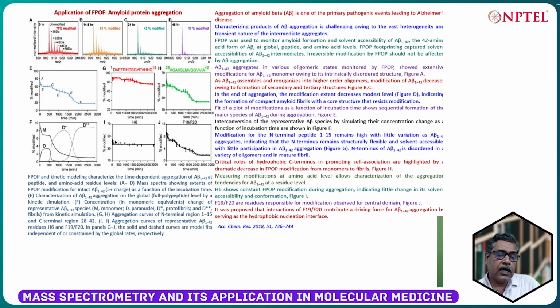These are the different types of oligomers that are being monitored in terms of their formation across different time intervals in the aggregation step.